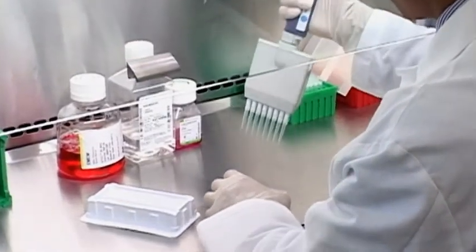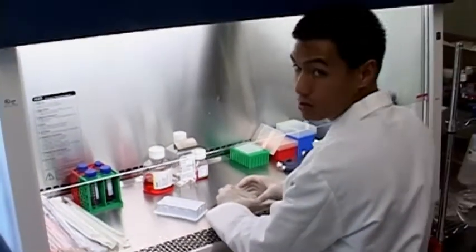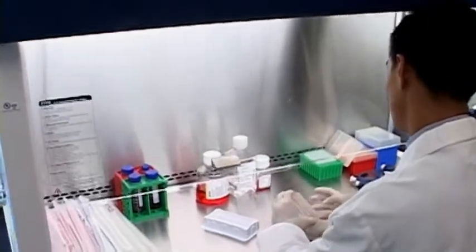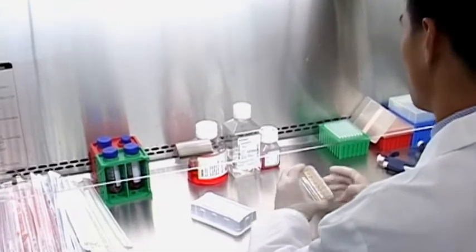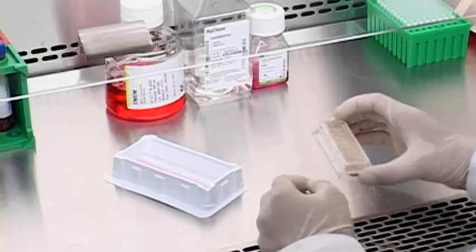Alright, and then from here, in order to make sure that the entire bottom of the well is covered, you can perform a visual inspection, and if not, then you can simply tap the side of the plate in order to make sure all the media is in fact coating the bottom of the plate. So now we're ready to obtain our first measurement.